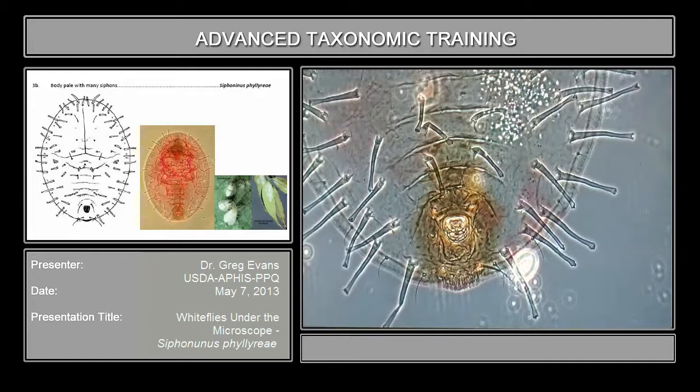With whitefly taxonomy, sometimes we deal with separating certain genera by key characters that only those genera have, to help us separate them from the mass of them.